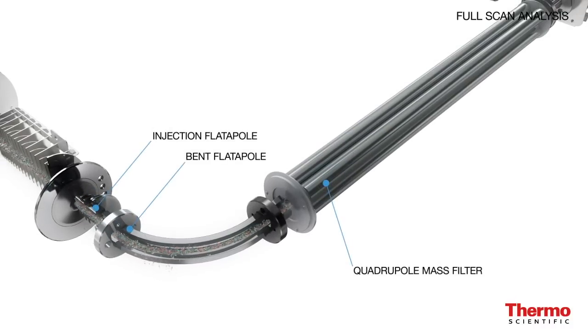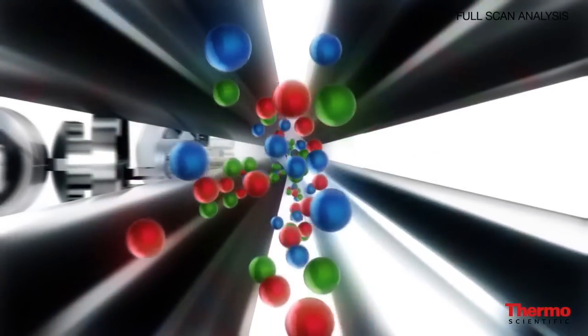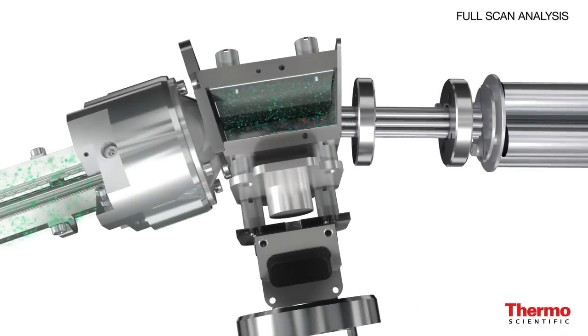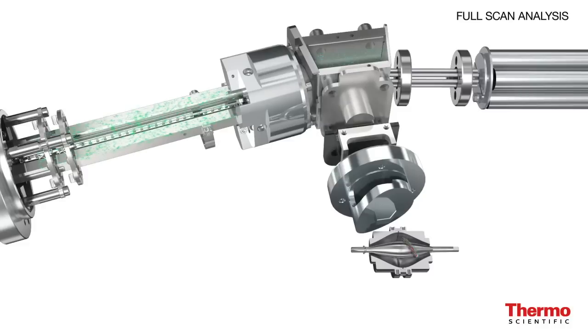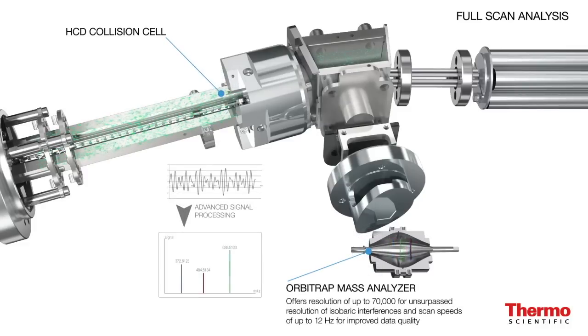But at the same time, from the same data acquisition, we would also be able to look at many other compounds that might be of interest, that are less likely to occur, but if they are there, we would like to know about it. The sensitivity we have now with the full scan instruments and the software allows us to do a really comprehensive analysis of the samples, looking for multiple types of residues and contaminants at the same time.